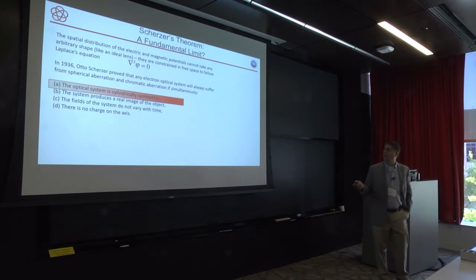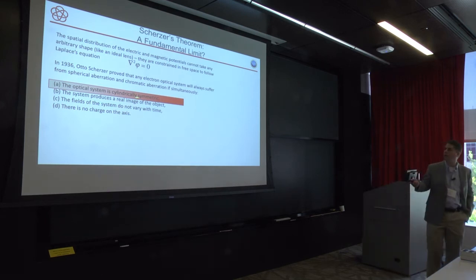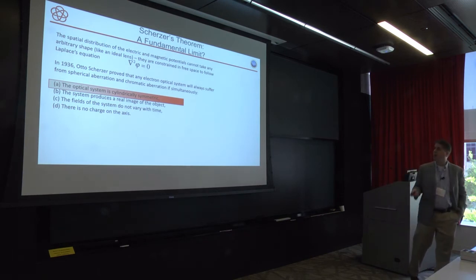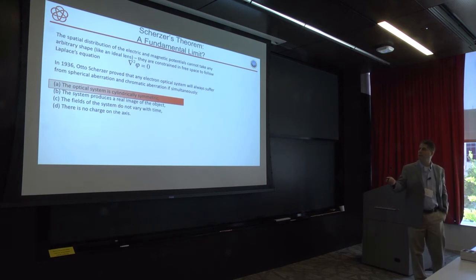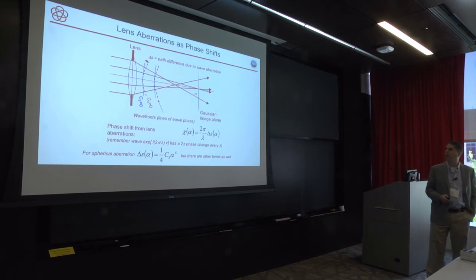I would point out that with CBB and with ultra-fast systems, we have one other opportunity open to us. We can work with time-varying fields. And so it's possible to do aberration correction with a time-varying field. And now that you have short pulses, that is in fact possible to do, and it hasn't really been very widely explored. But that, I think, is a huge opportunity going forward.